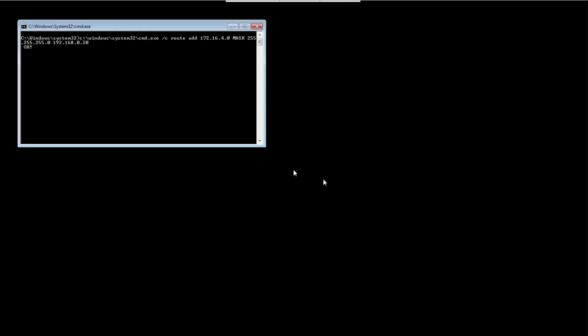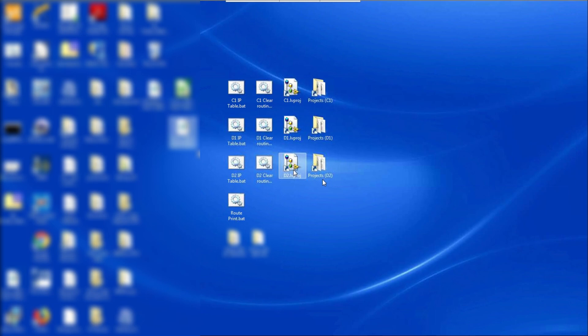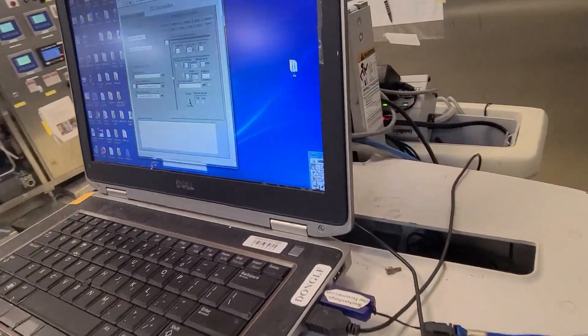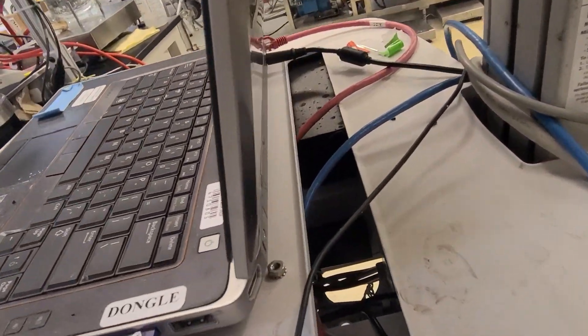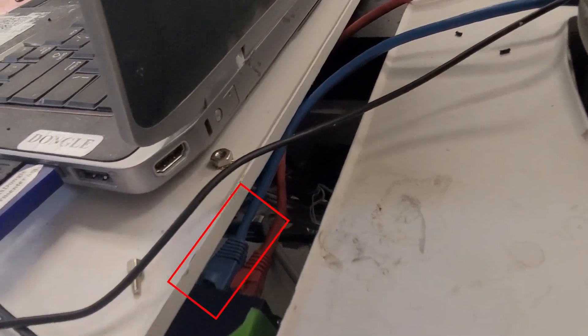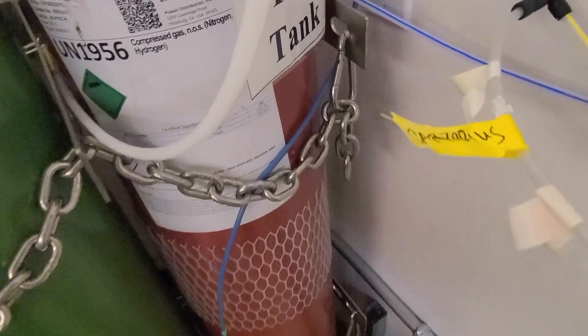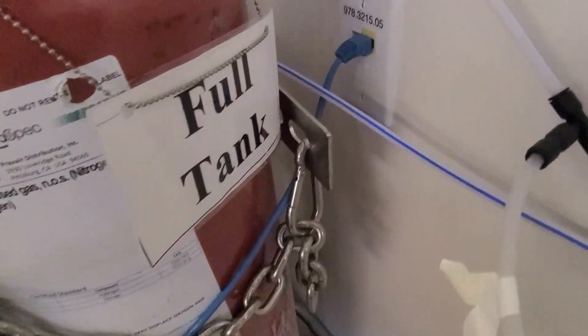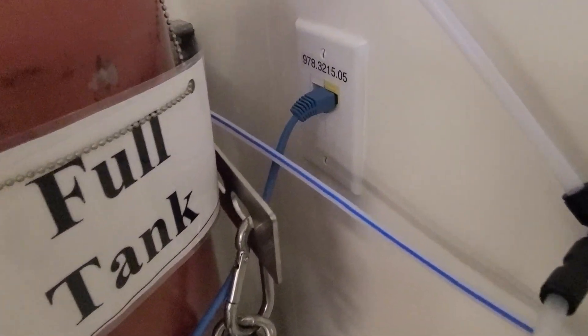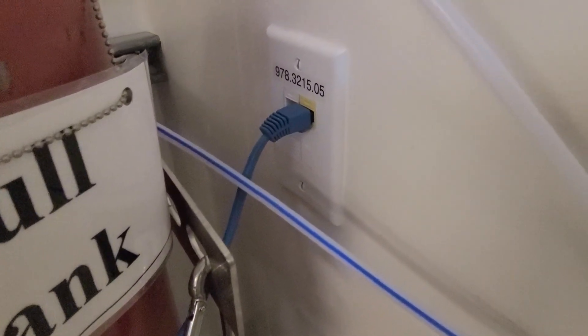A command prompt will then pop up briefly and should disappear right away. Don't forget to plug in the Ethernet cable into the internal network switch. This is important for the routing connection to work.